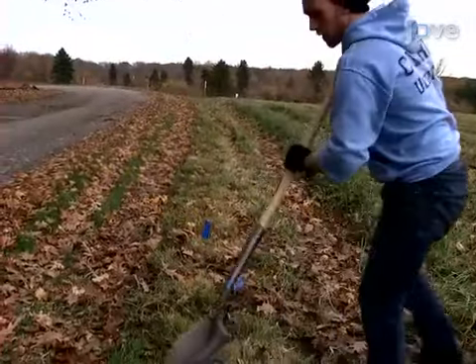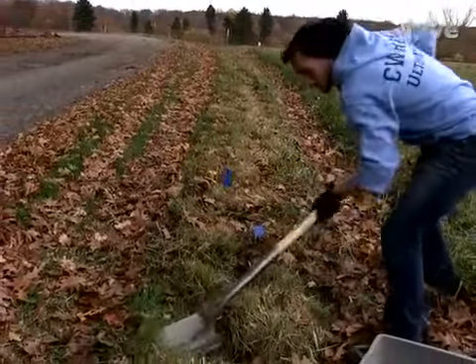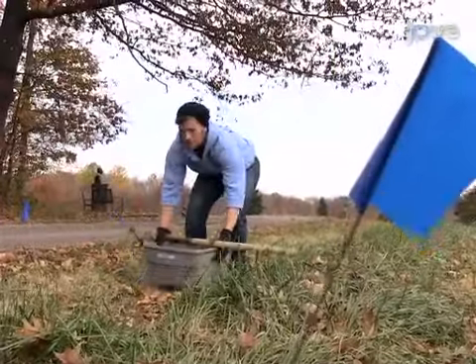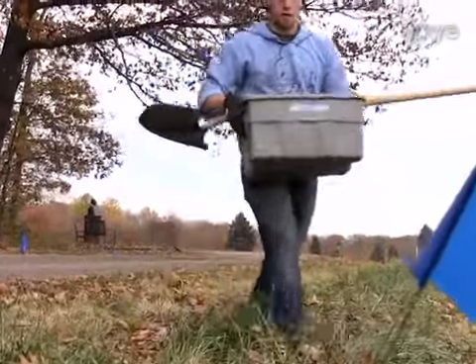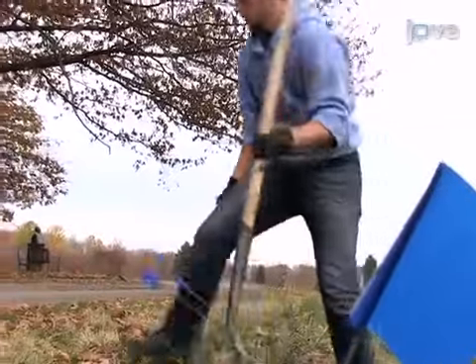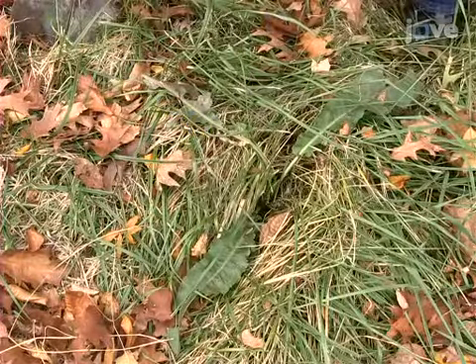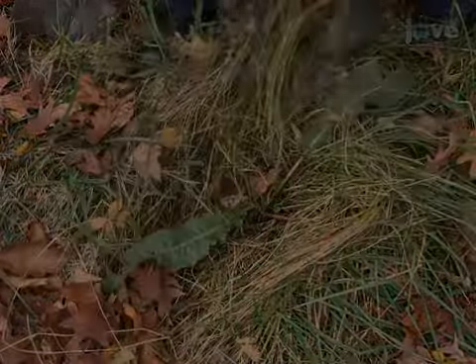To produce heterogeneous and homogeneous field soil treatments, begin by collecting field soil from marked individuals of the two focal species of interest in replicate batches to avoid pseudo-replication. Using an appropriately labeled sterile shovel and gloves, next, dig up the complete root zone.